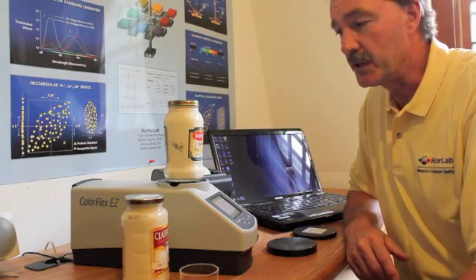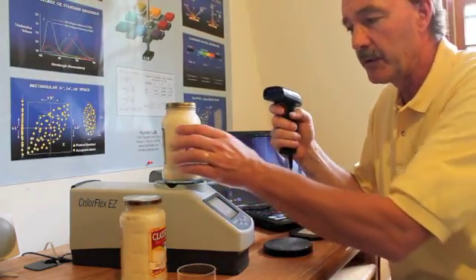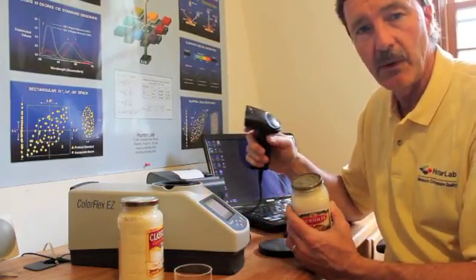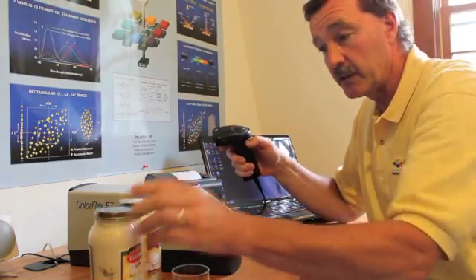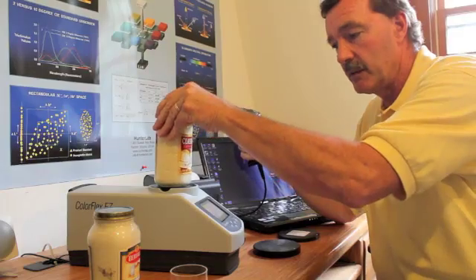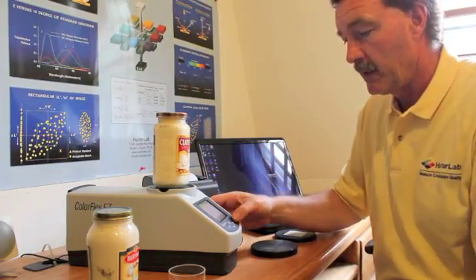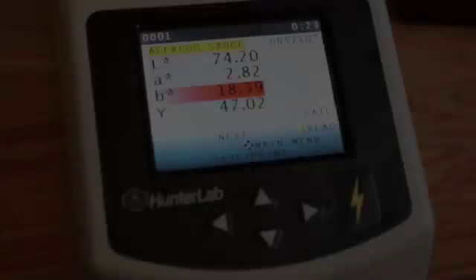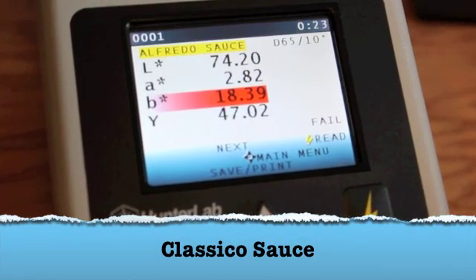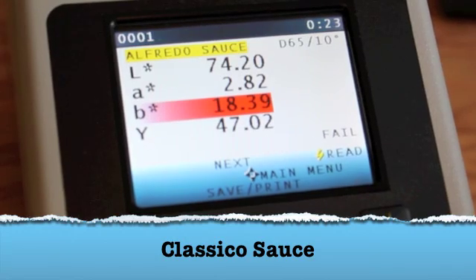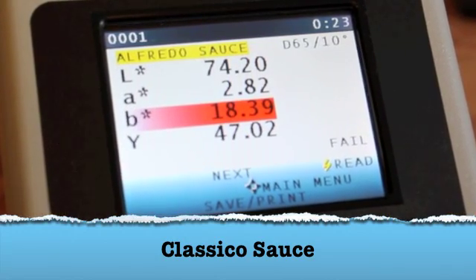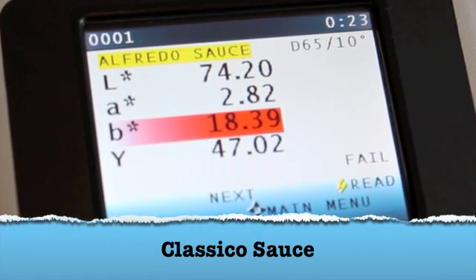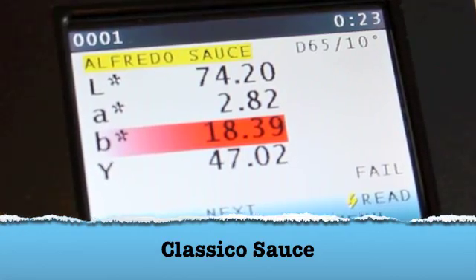Another useful feature is the barcode reader, where we can very simply use the barcode information to include that with our color data. Now measuring our second sample, we simply place it and take a reading, and the data is presented. On the second screen, we've taken a measurement of the Classico sauce, and it displays the B values being 18 units and out of tolerance. This is about 2 units larger than the first sample, which was our Bertolli sauce.